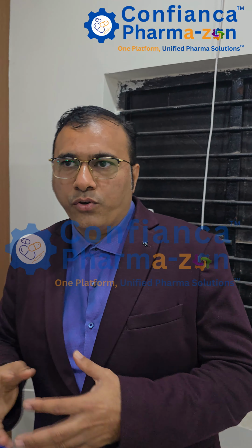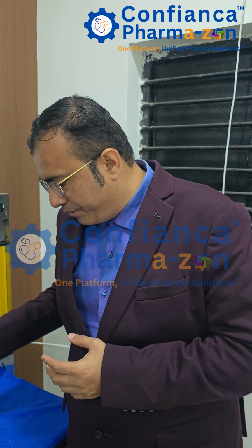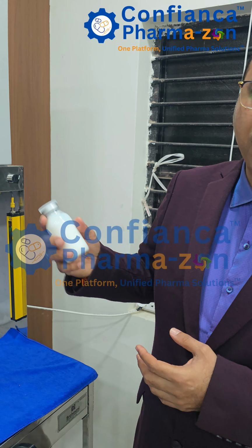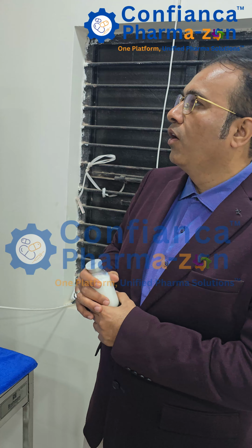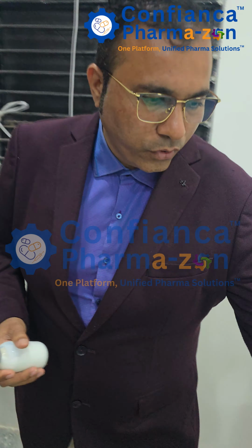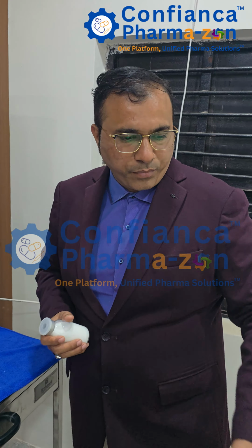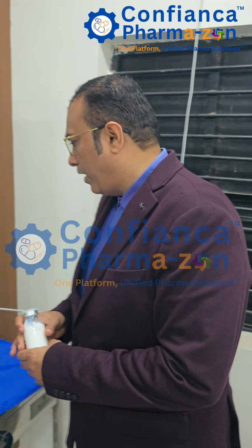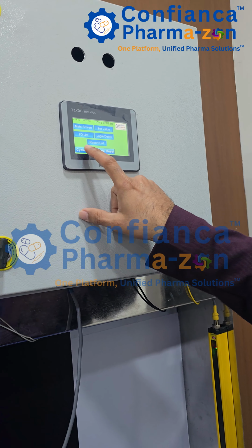You can use 8000 to 9500 lux for products that are difficult to visualize, and for clear products like this, where you can visualize the entire part, 2000 to 3500 lux. So let us start now. I have put the set point, and now I will do the cycle start.